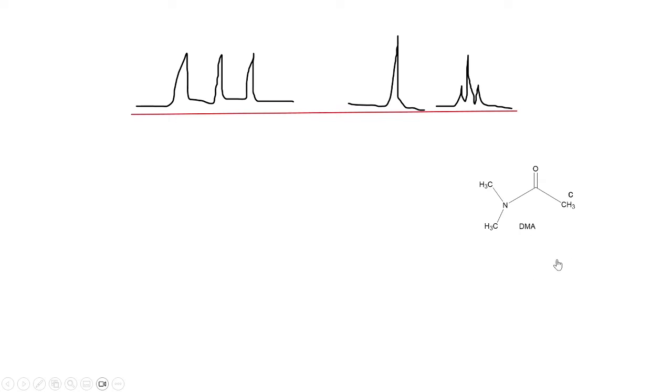So here in the example, the internal standard is DMA, dimethylacetamide. Specifically, just see this methyl group, it has 3 hydrogens, and this is used as an internal standard. Based on that you can calculate the other peak concentrations. This methyl peak is this, so I did the integration. It is for 3 protons, remember, it is for 3 protons.